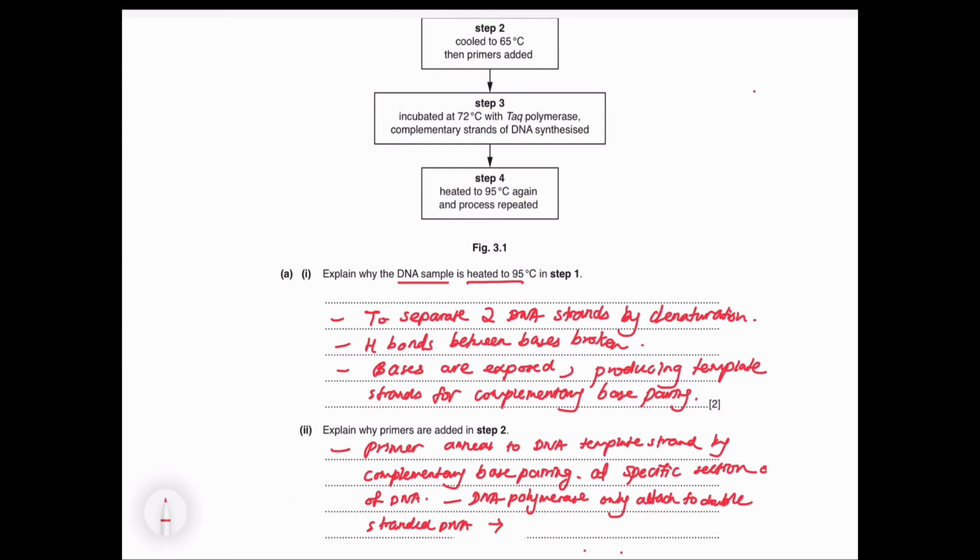In other words, it prevents the DNA from re-annealing. If not, your process of denaturation will be wasted, because as they re-anneal, the double strands will rewind and you wouldn't have the template to be replicated.